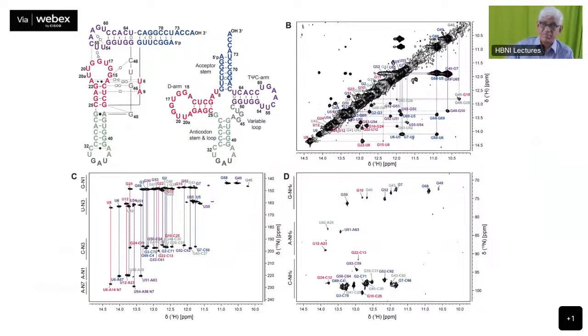So there are various methods called in vitro transcription methods; in vivo experiments can do that, but it is not easy. Anyway, people have synthesized this using certain labeling procedures, and this is the nitrogen-labeled RNA sequences. So you will see correlations with regard to the nitrogen. So what are the correlations seen there?